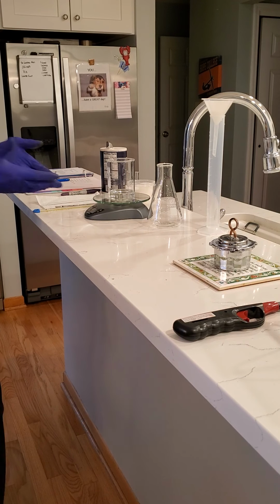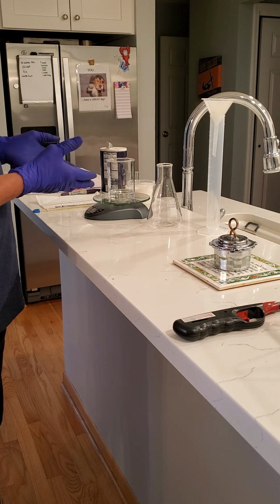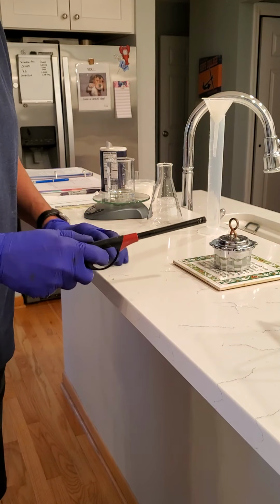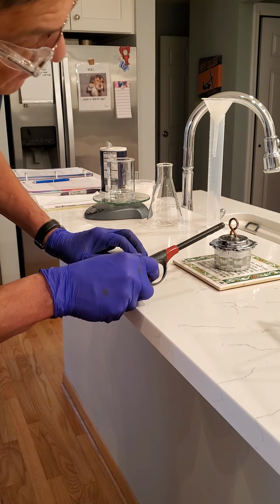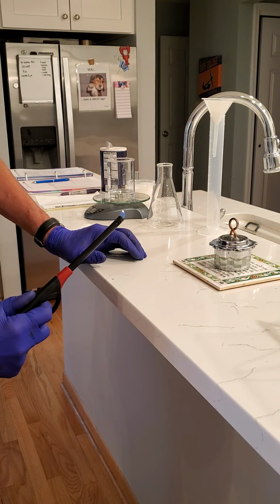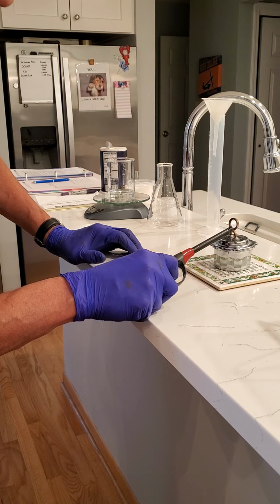Now what we're going to do is heat this beaker until all the water is evaporated, and we're going to weigh the amount of solid salt that's left over. To do that, we're going to use our little alcohol burner, which I've got set up here and ready to go. So I'm going to light it. Get it going.